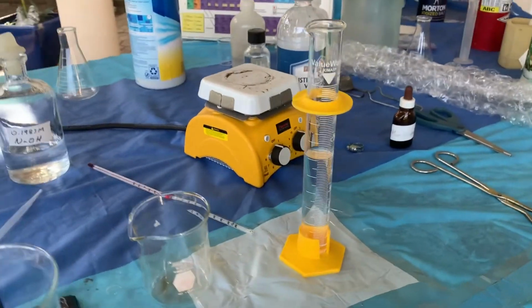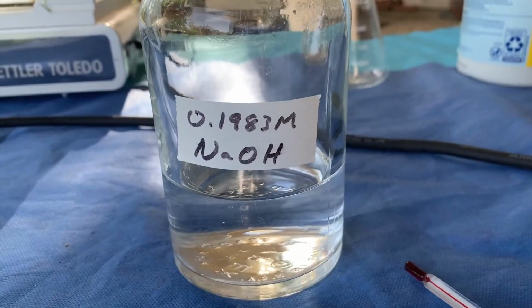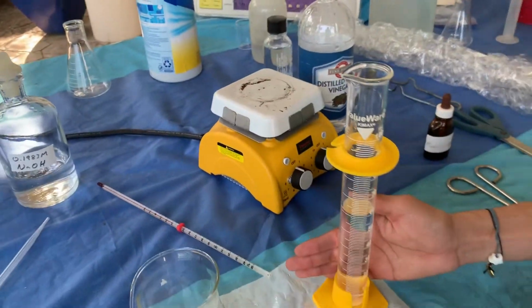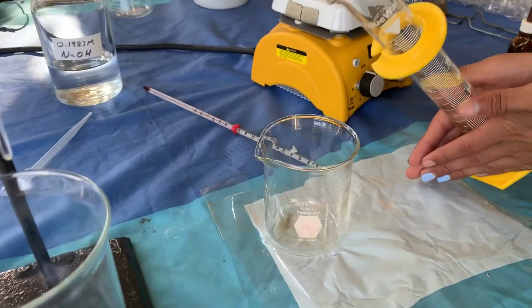Okay, so first you're going to get 60 mLs of 0.2 molar sodium hydroxide. This is the actual concentration. Record that. So transfer this to a 250 mL beaker.